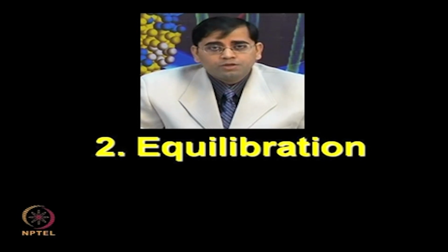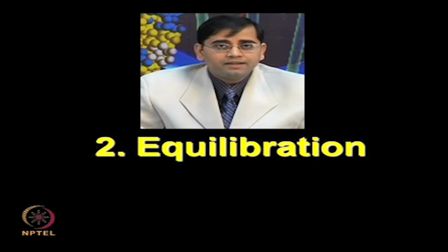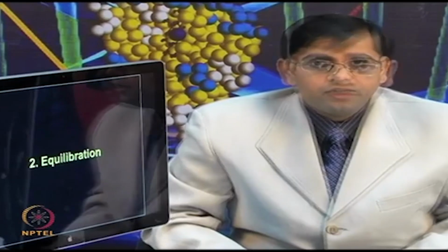Now, two-dimensional electrophoresis is different from doing SDS-PAGE alone. The concept of SDS-PAGE is the same, but here there will be variation. You do not need to add the stacking gel. You need to prepare your protein sample, which is already focused inside the strip in the first dimension. This IPG strip, which was put in the electrophoretic unit in the IEF instrument, needs to be prepared so that proteins can be separated further based on molecular weight.